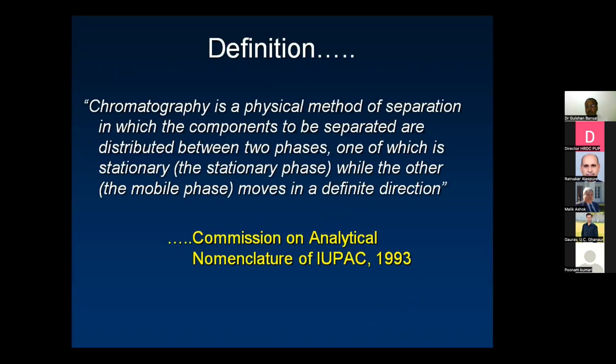So we will be concentrating more on liquid HPLC and UHPLC because these are the most common techniques. More than 90% of the chromatographic analysis of contaminants is performed using HPLC or UHPLC. So what is chromatography?